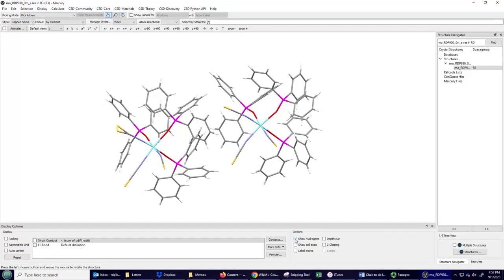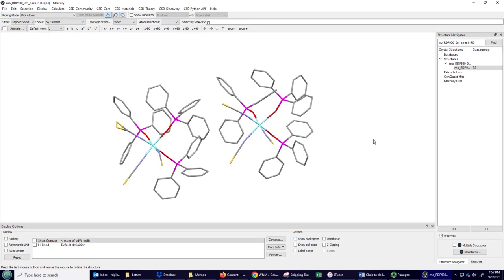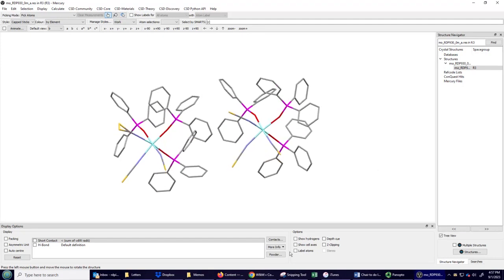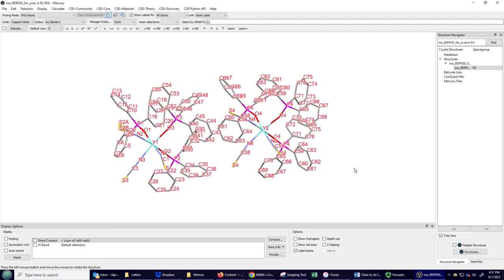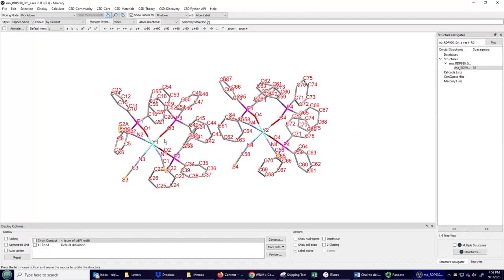And in fact, let me turn off the hydrogens here. The hydrogens are in white and they make things a little complicated, so I can just shut those off. You recognize some six-membered rings, phenyls, if you remember your undergrad days. And these two structures, I think you'll see, are not quite identical. If I label the atoms, one of them is based on yttrium-1, and here's yttrium-2, and the oxygens over here I've got 1, 2, and 3, and here I've got 4, 4, and 4.